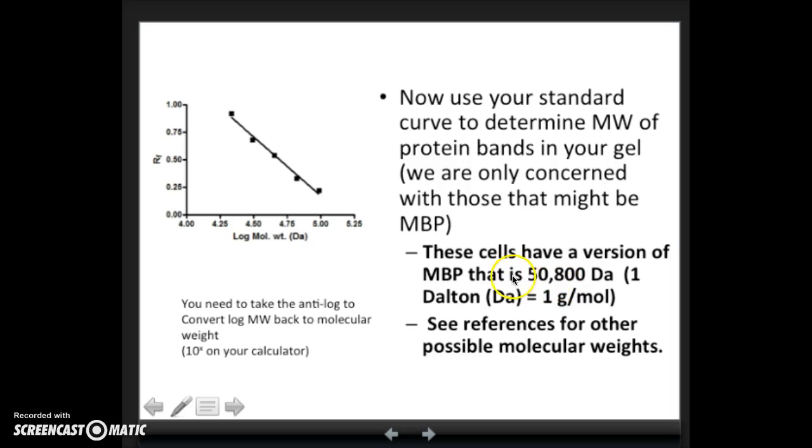Just to have something to compare it to, the maltose binding protein that is in our cells should be around 51,000 Daltons, so 50,800 Daltons.